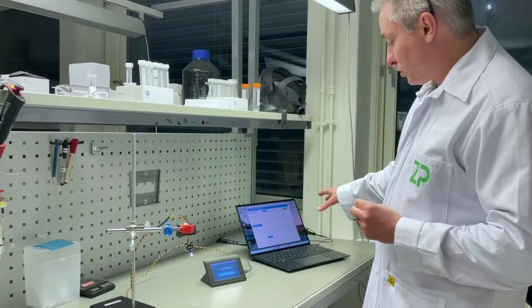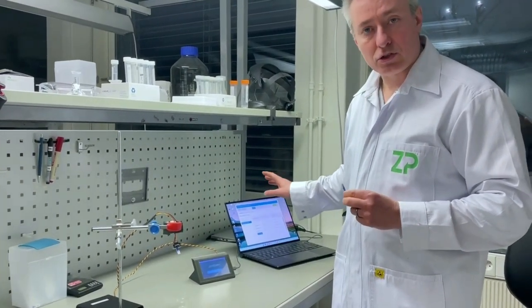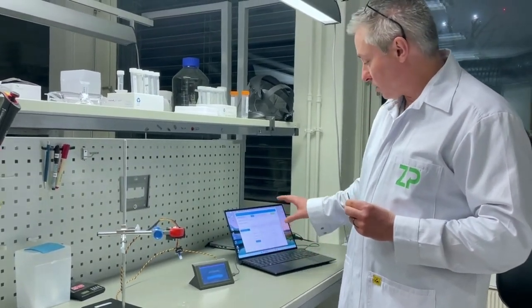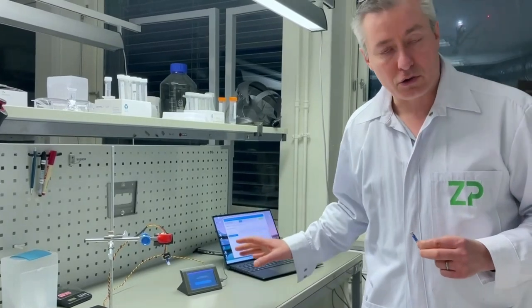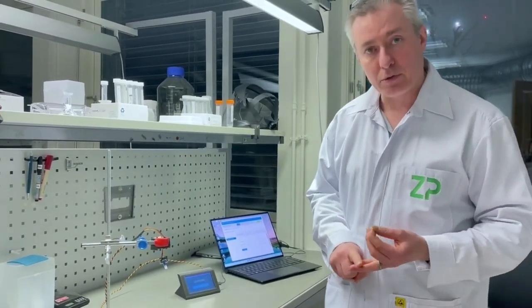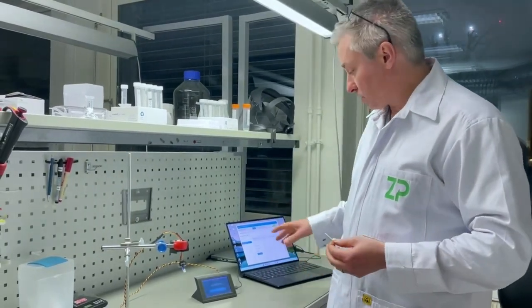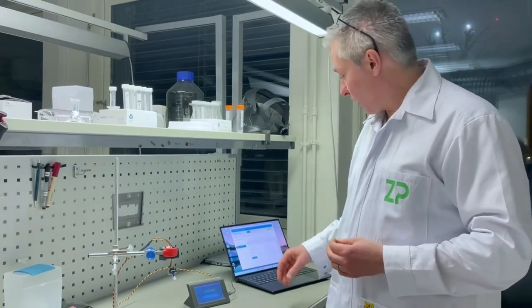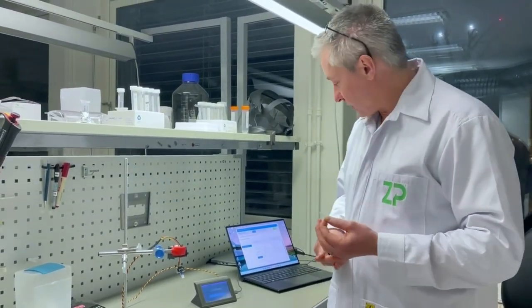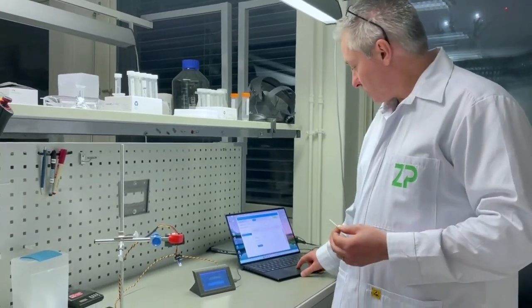On the computer what we have here is the software running the meter. I've chosen chronoamperometry, but we're perfectly happy with impedance, open circuit potential, and voltammetry. For this chronoamperometric experiment, I just tell the software the offset voltage, the current range I'm going to be working in, and my run time, and then we hit start.